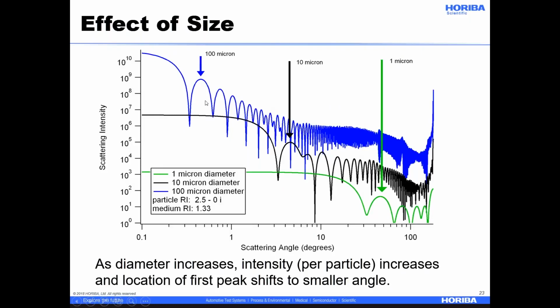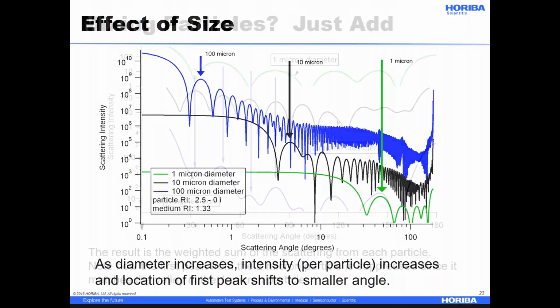One is this rule holds. These are Mie scattering calculations, and so I include the particle refractive index and the medium refractive index, just so I remember how I did it. We calculate out to very wide angles, and then we also see that this first order peak, that relation holds. Small particles, the peak keeps moving to wider angles.